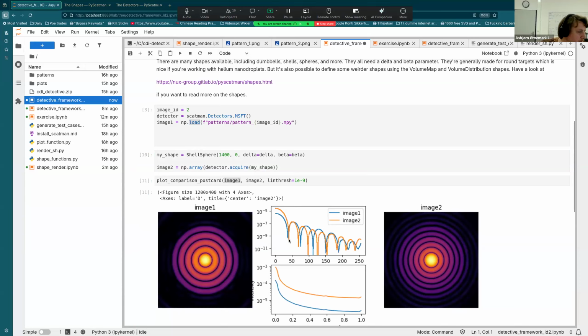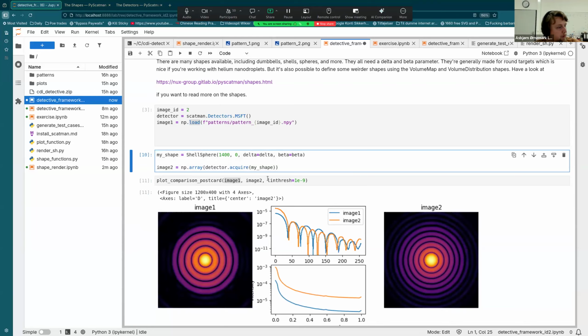Somehow it works for the first beat, but then it gets off on the second beat. So probably right now, you can see this shape I'm trying to compare it to is just a shell sphere with a hard edge, right? And there's a radius, and there's no transition. There's no shell outside, rather. Are there any guesses for what we could try to compare it to otherwise?